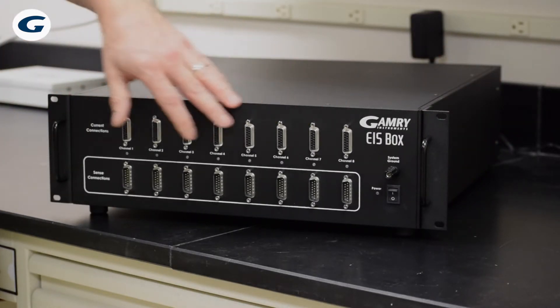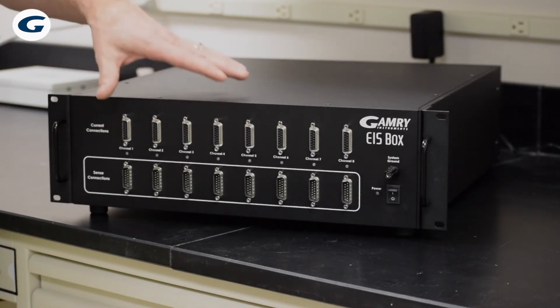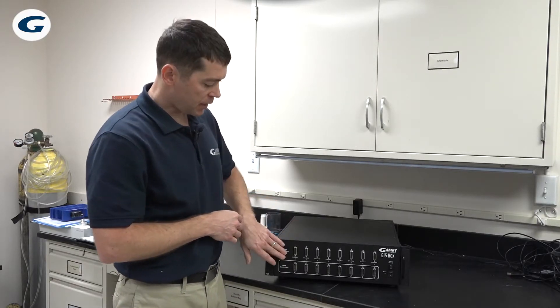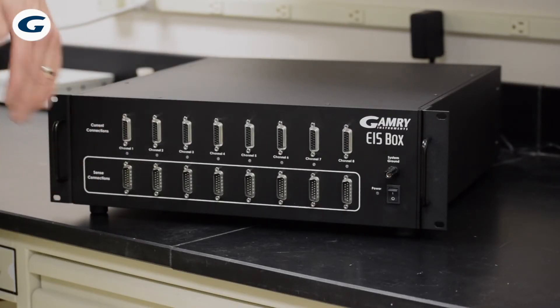It has eight measurement channels for up to eight cells. The standard configuration is three meter cables, but other cable lengths are available. We separate the sense lines and the current lines so you can reduce your mutual inductance and make a better measurement.